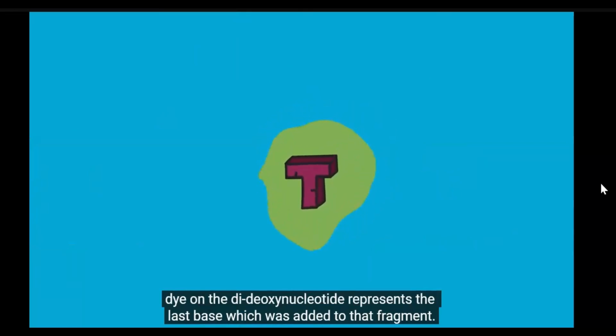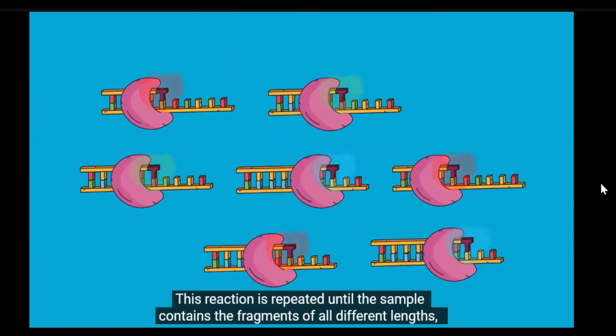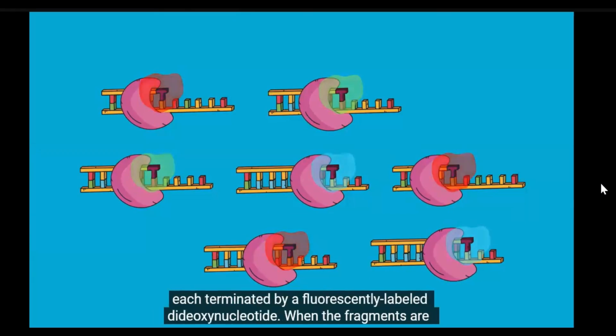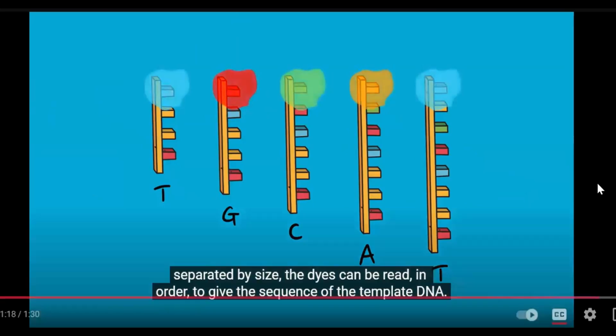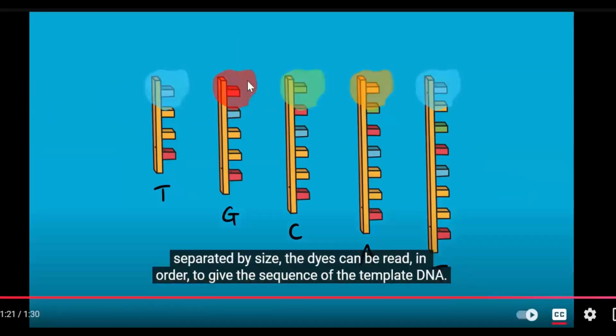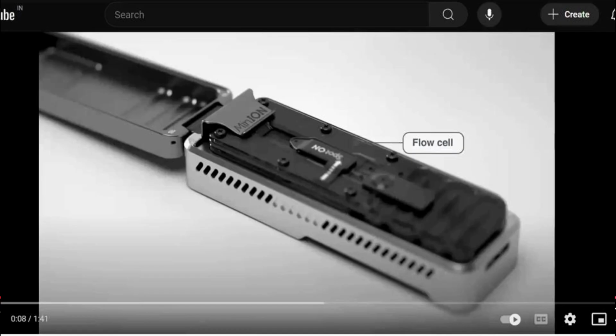That is how you get a series of fragments having different lengths, each terminated with a specific base. So by reading these fragment lengths and the base at the termination, you can write the sequence. As you can see, the fluorescence of each of them is different, A, T, G, C.